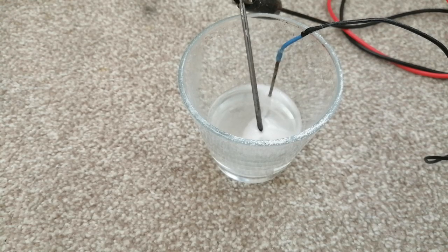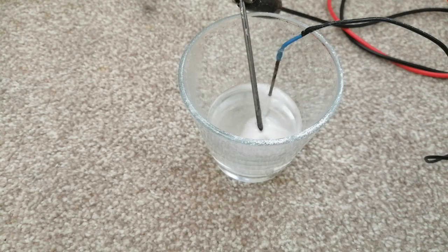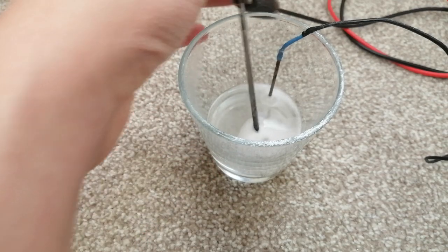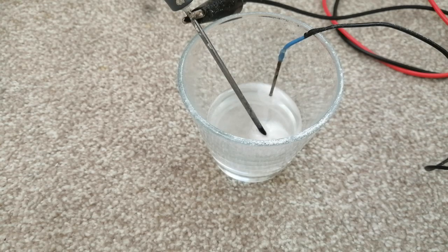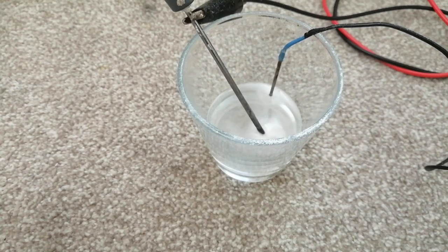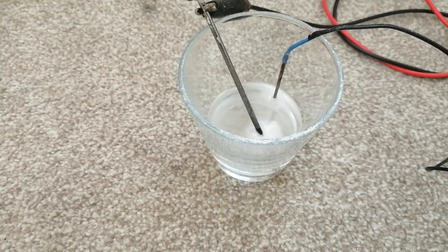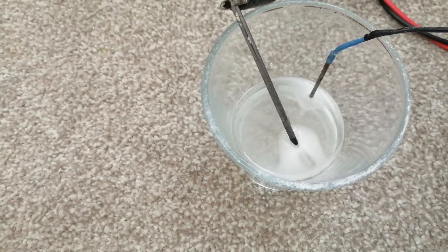Hello, in today's video I'm going to show you another quick and simple way to make sodium hydroxide. Instead of using a membrane, we're using sodium carbonate, which will decompose into two main products: carbon dioxide, which is basically the carbonic acid, and hydrogen. This process won't produce high-purity sodium hydroxide, but it's sufficient enough for the majority of users.